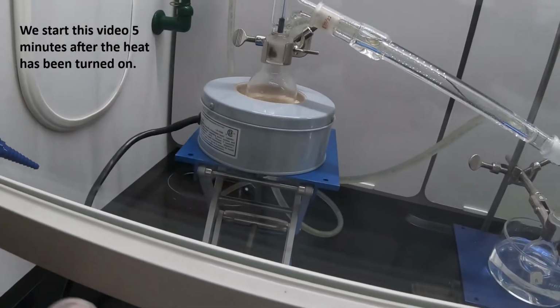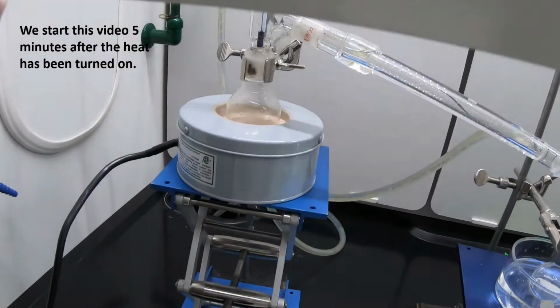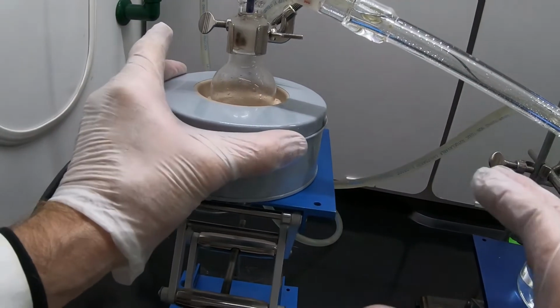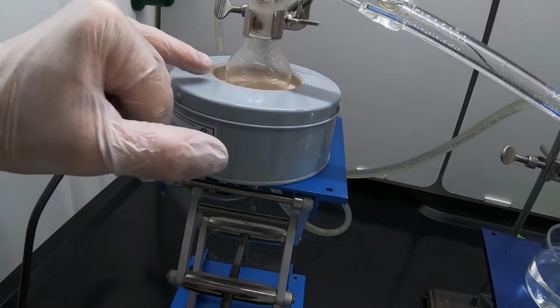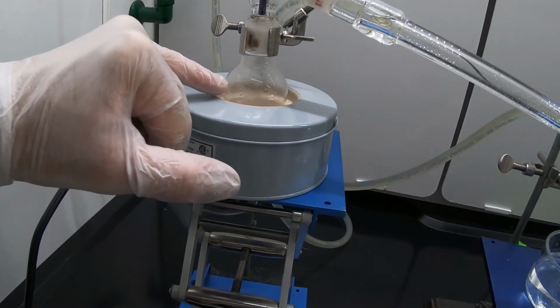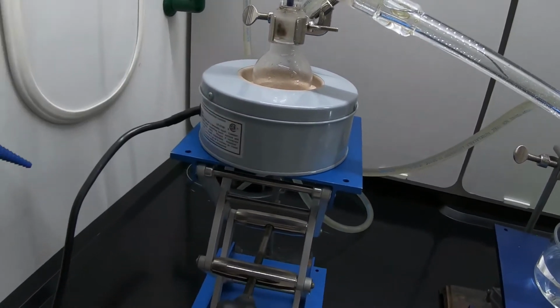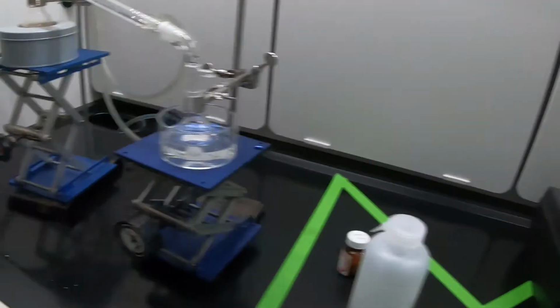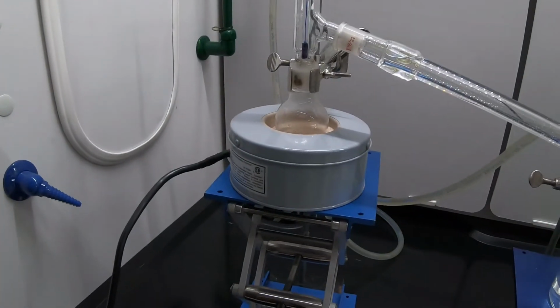At this point, it's been 5 minutes. The distillation hasn't started. We've gently started to warm the flask, and if you look closely, I'll lift up the sash. There is some condensation vapor starting to build around here. So that tells us that things are starting to happen. I don't know if you can see, there's very, very small bubbles present.